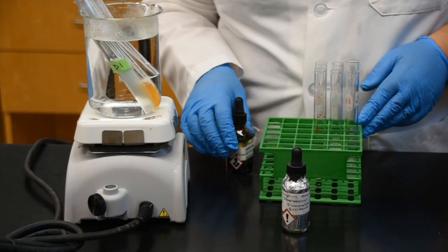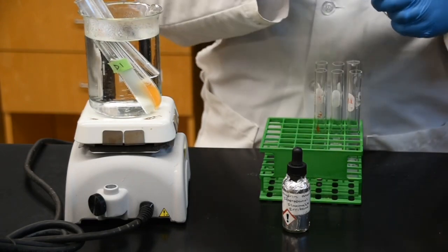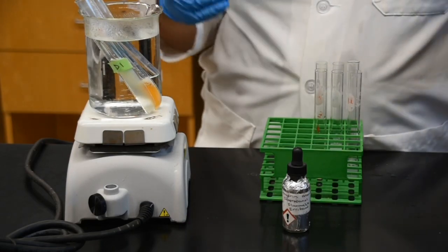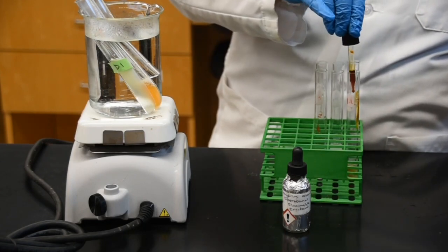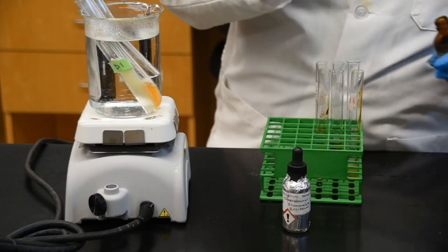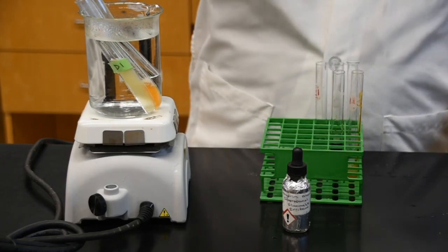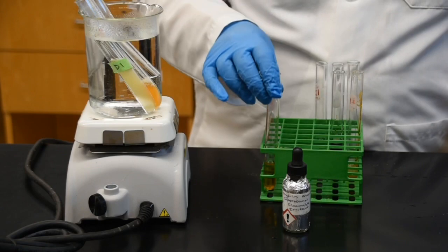So let's go ahead and add our Lugol iodine to our 3 samples. And again, we're looking for yellow if there is no reaction, and we're looking for bluish black if there is a reaction. So here are a few drops. And again, let's take a look. Yellow means no reaction. This is our simple sugar tube, so technically, we will not be expecting to see any color change.